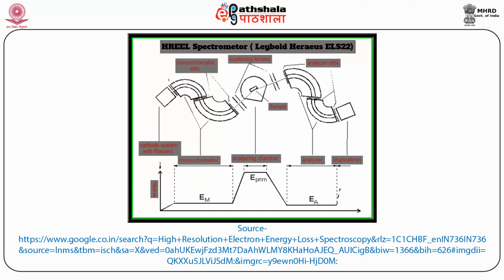The task of the monochromator is to reduce the energy of the passing electrons to some electron volts with the help of electron lenses. It further lets only those electrons pass which have the chosen initial energy. To achieve a good resolution, it is important to have incident electrons of a well-defined energy.